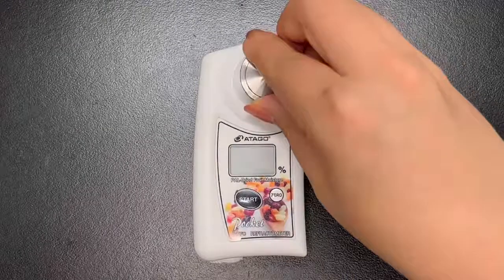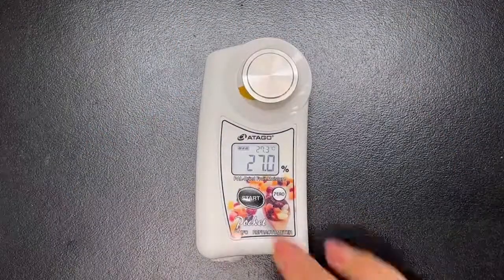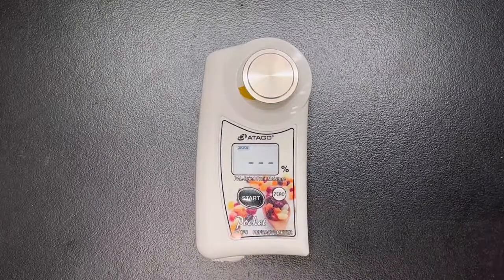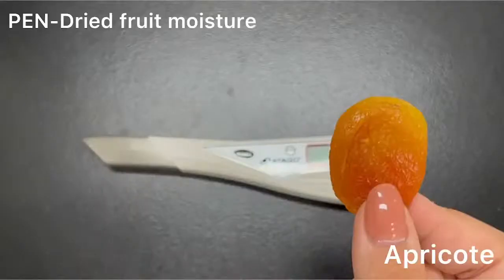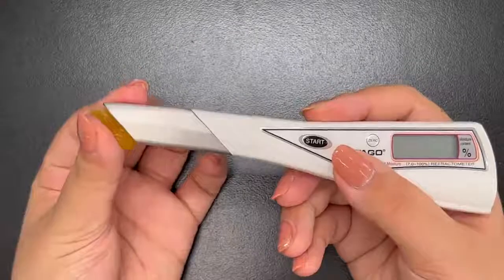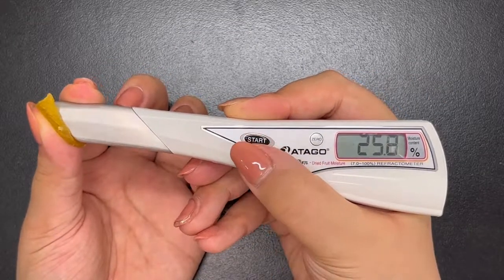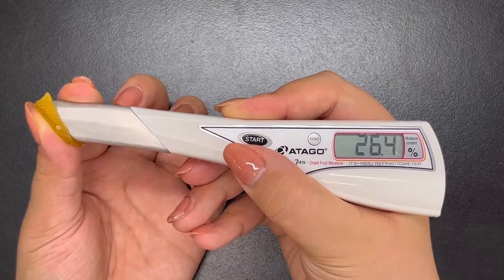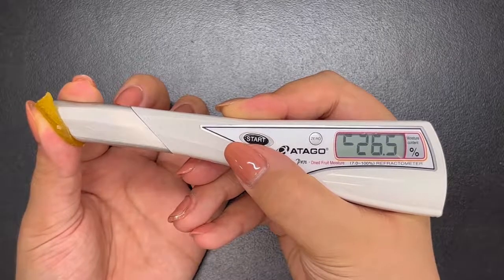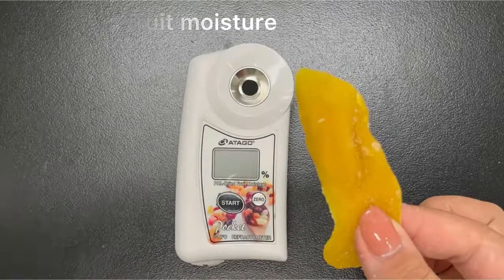Now let's see the apricot. As mentioned before, with dried fruits you have to cut into small pieces and make sure you are pressing the sample stage well. As I said before, the moisture content of apricots is about 20 to 25%, and we can see here that there is no problem with the measurement and it is correct.